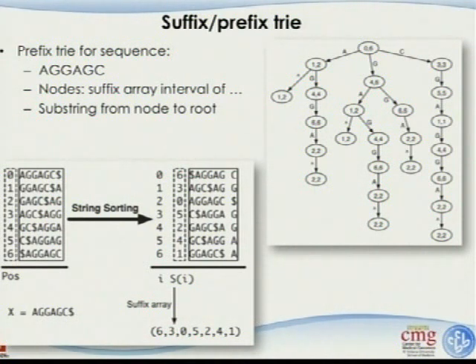And the computer scientist told me that this gives you a very fast searching scheme, which is O(N), where N is the size of your read, the query sequence, which is 50 base pairs, not the length of the entire human genome, which can be very, very huge. So the seeding, the searching part is very, very fast, okay? You probably still don't know how this works, and I'm not going to explain that because I don't know either, but that's okay. It's not going to be used anyway.